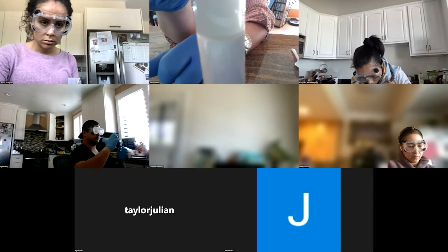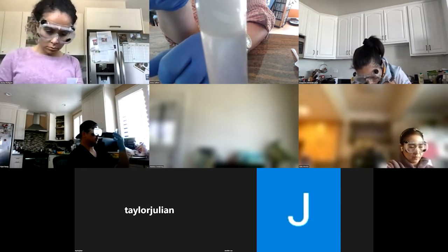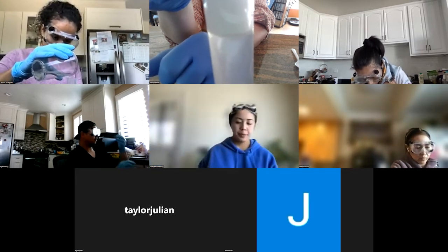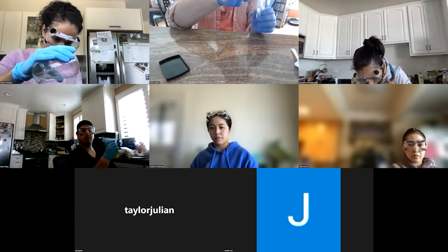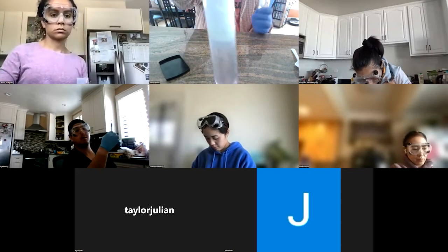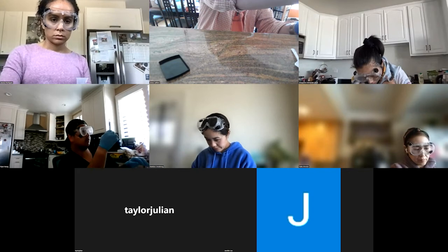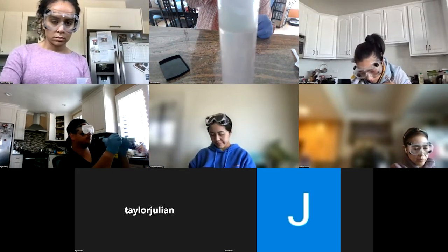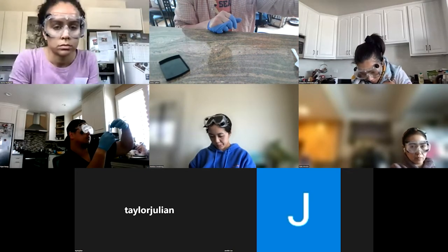So this time the oil did not go into the micelles nearly as well. I mean, some must have, but you can see the oil layer here. Whereas before, with the soft water, there wasn't. It took about 2 mils of oil for you to finally see a layer of it. This was only 3 drops. Yeah, so the hard water definitely makes a difference.